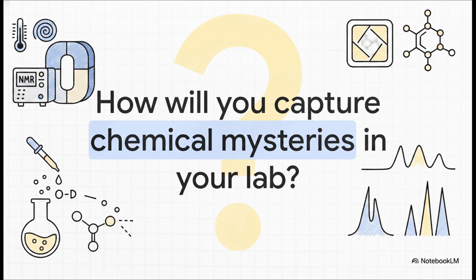By manipulating the temperature to freeze reactions, controlling purity and concentration to affect hydrogen bonding, or using heavy water to perform literal disappearing acts, you dictate exactly what that camera sees. You are absolutely no longer at the mercy of unpredictable chemical shifts or blurry broad peaks. So, the question is, how will you use these tools to capture the chemical mysteries in your own work?